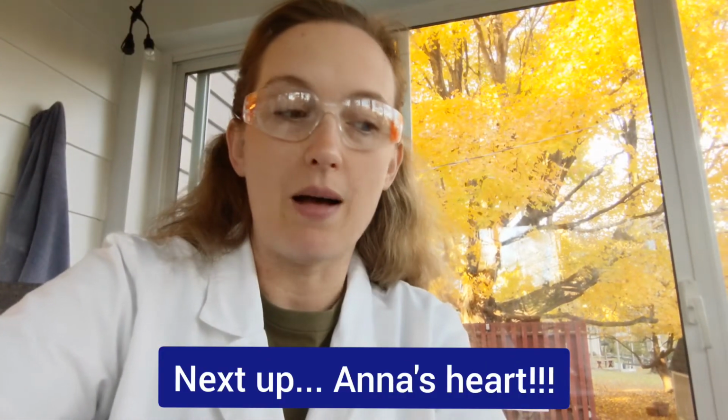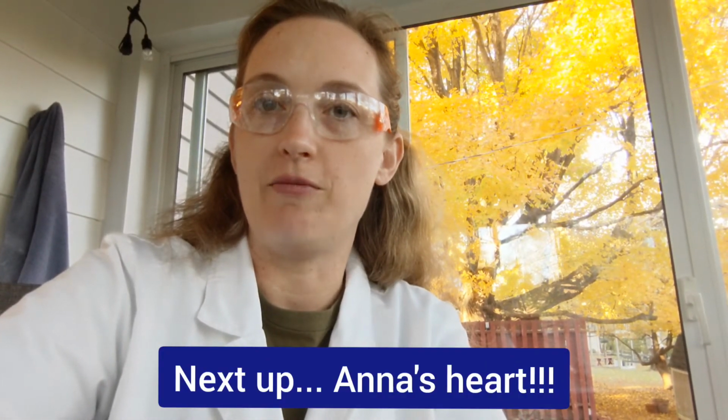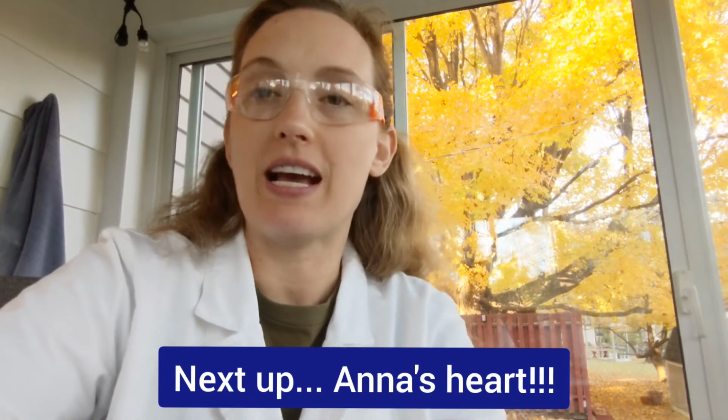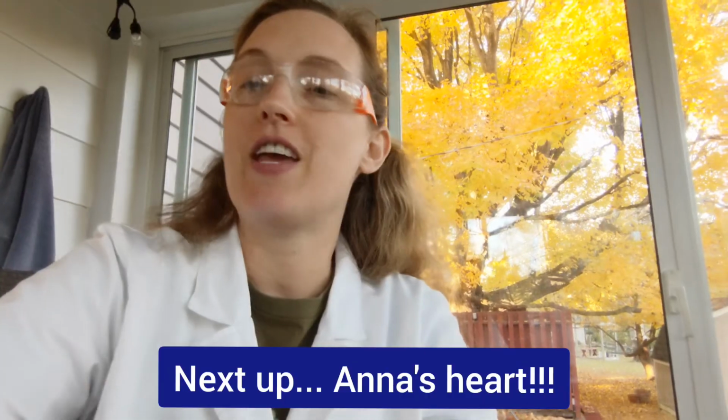Your teacher might opt to show you a video of me examining Anna's heart, or might show you pictures. But either way, your next step is to look at Anna's heart, figure out whether she had any abnormalities that might be connected to her death or not. Sorry, I shouldn't smile when I say that.